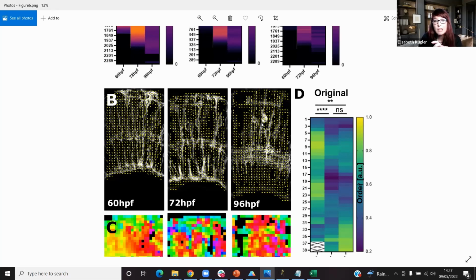But also B, another thing is that you can look at Sholl analysis, where you plot your center points, and then you can measure how many branching points you have the further you go outwards, which is again something in Fiji that you can do in 2D and 3D. I personally find it mostly sufficient in 2D, to be honest, and it works very fast in 2D as well. Whereas 3D. Favorite tool for that on Fiji? I think it's literally called Fiji.